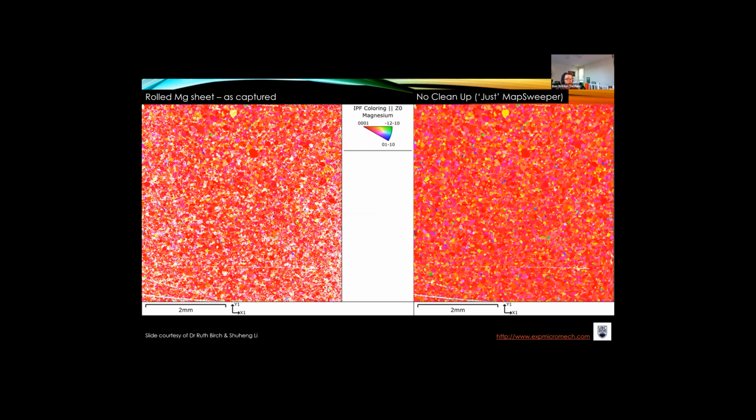So you can put a thin, say, carbon coating across the surface, and that can dissipate the charge. And then in those cases, you actually increase the voltage to get through the coated layer. So you're going to go up to 30 kV, and then you might nudge it down depending on how you play, but you want to have a controlled thickness of that sample.